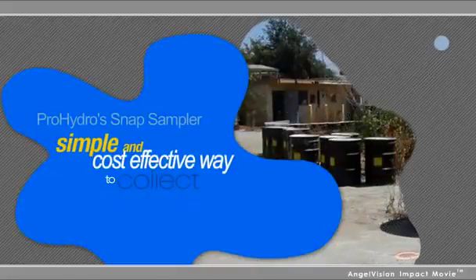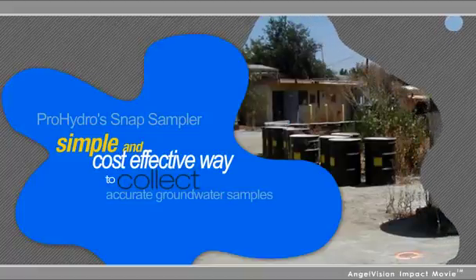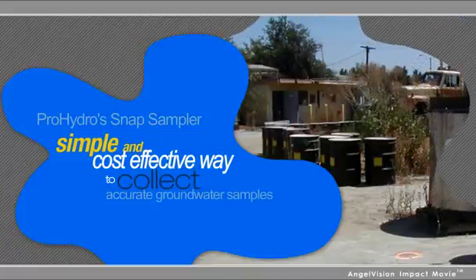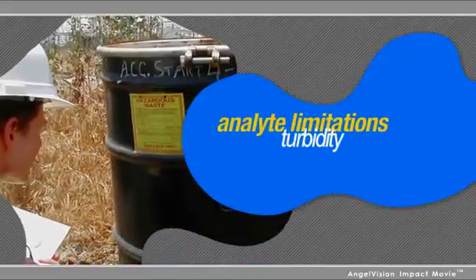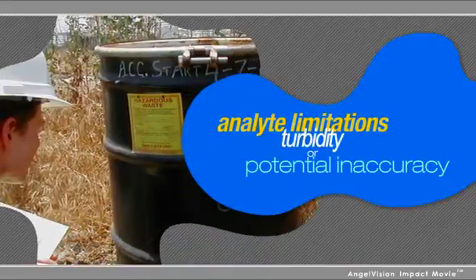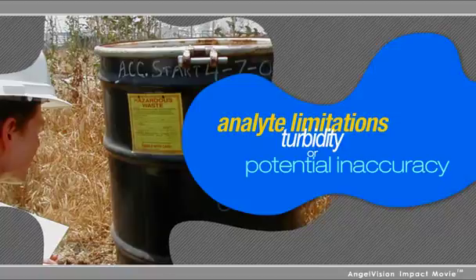Pro-Hydro's Snap Sampler is a simple, cost-effective way to collect accurate groundwater samples without the effort and waste generation of purge sampling, or the analyte limitations, turbidity, or potential inaccuracy of other no-purge sampling methods.